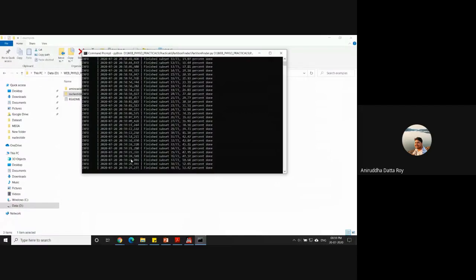How many partitions are there? 9 partitions. Yeah, so I have 9 partitions to start with, and what it is going to tell you at the end of the analysis is how many of these partitions evolve in a similar manner. Then it can reduce the number of partitions that you have, thereby reducing over-parameterization. Okay. We're almost done here.